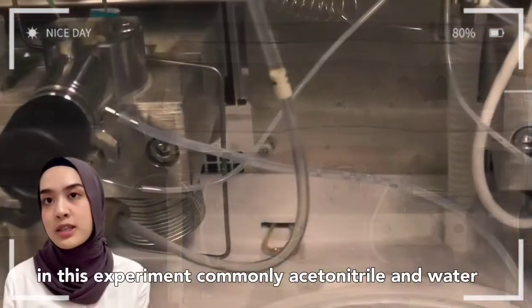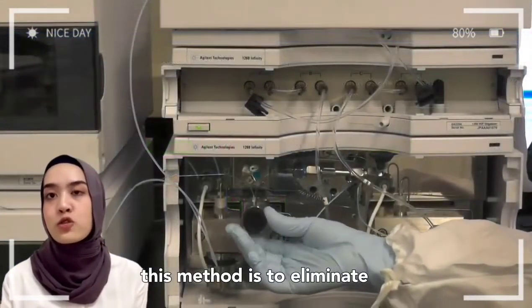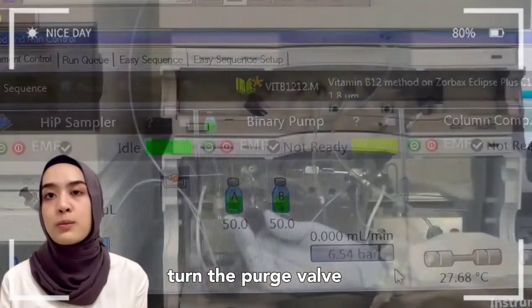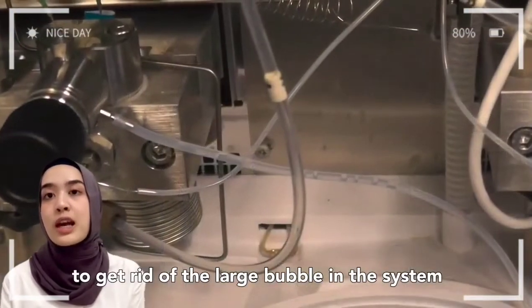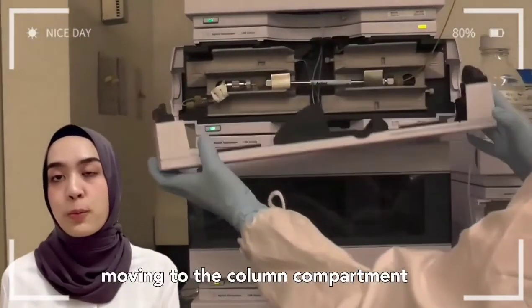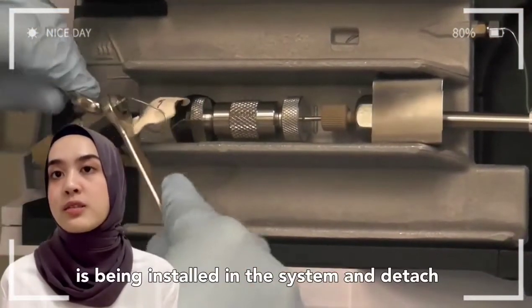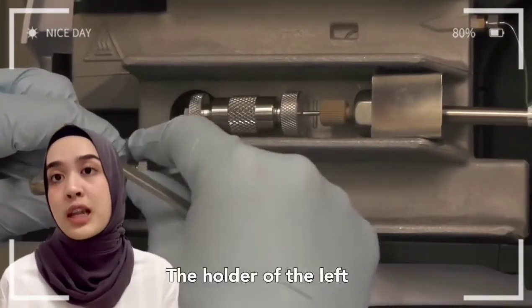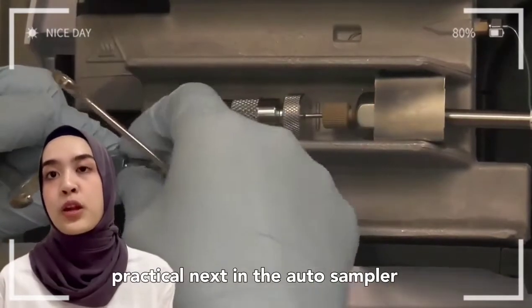The mobile phase that we use in this experiment is commonly acetonitrile and water. This method is to eliminate the dissolved gas from the sample. And then turn the purge valve in the counterclockwise direction to get rid of the large bubbles in the system. Moving to the column compartment, first we need to open the column compartment to ensure that the right column is installed in the system, and detach the holder of the left column compartment to get rid of the leftover liquid from the past or previous practical.